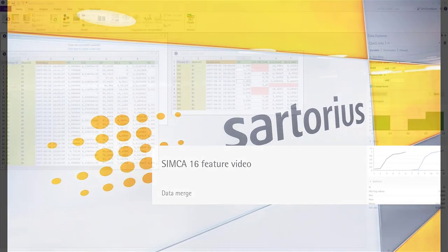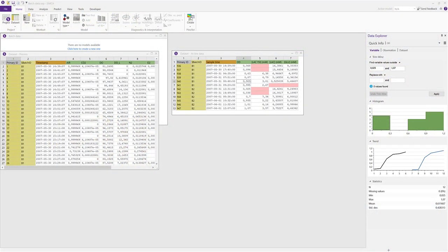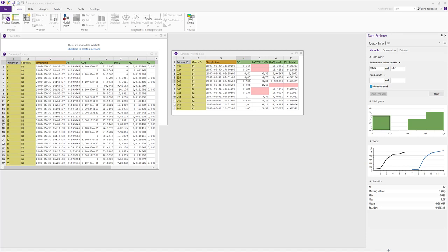We start with some batch process data. Here to the left we have process data collected every second minute, and to the right we have manually sampled at-line data collected a few times every day. The objective is to merge these two data sets so that the at-line data is aligned into the process data table at the correct time points so that we can model them together.